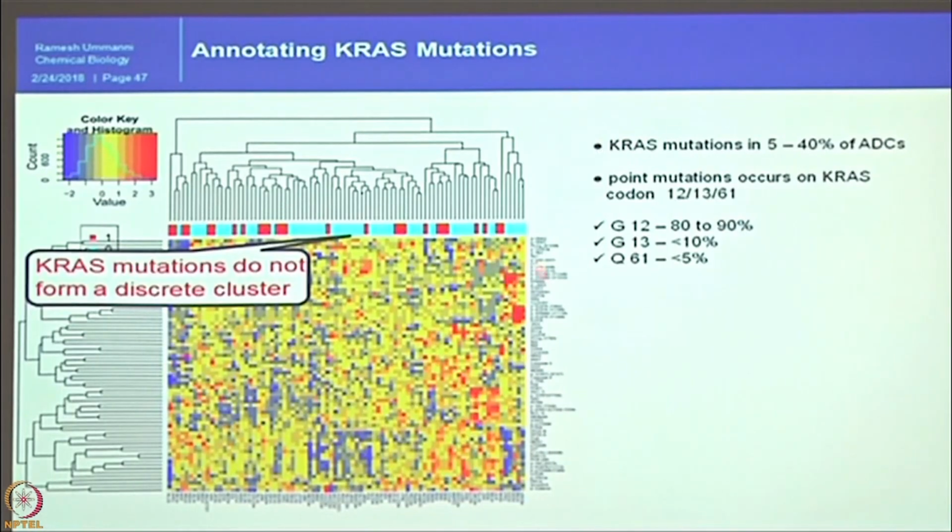The major cell line population has KRAS mutations, and the KRAS protein can be mutated in 3 different places. Usually when a patient is declared to have a KRAS mutation, the doctor thinks that okay, X drug can be given. But within the KRAS mutated patients, if there are different subpopulations, a drug that works for some set of people will not work for others. This can be addressed by the RPPA approach. How can you see that?